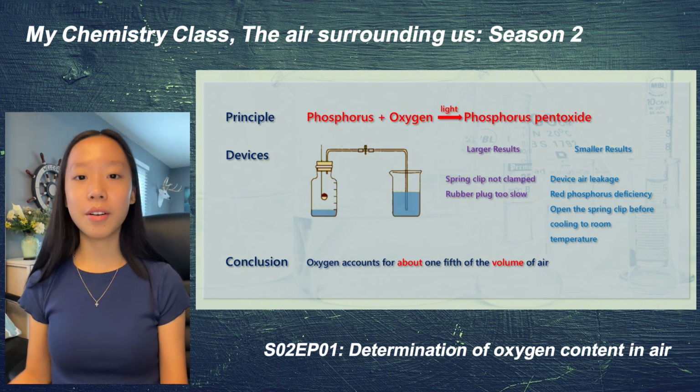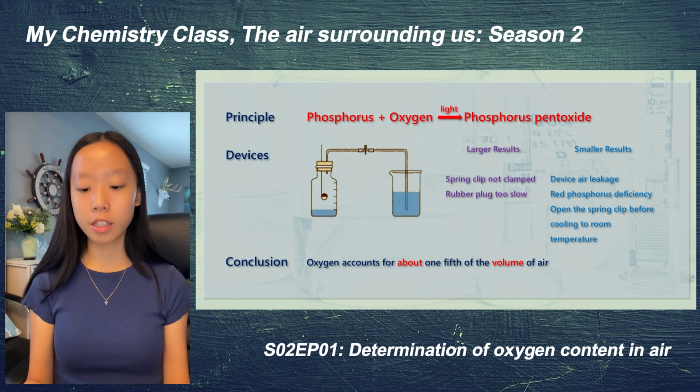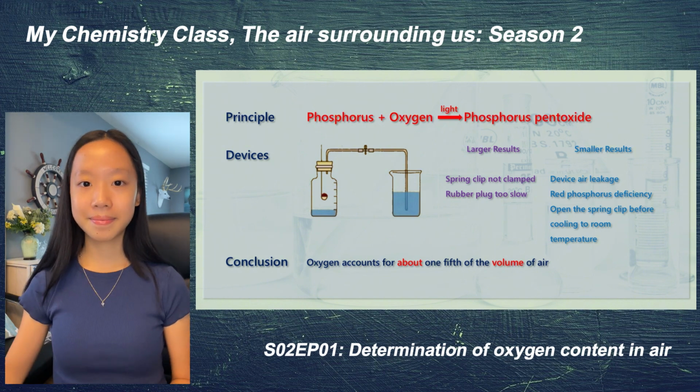And here is the whole chemical equation for the experiment. It's phosphorus plus oxygen, ignite, equals phosphorus pentoxide.